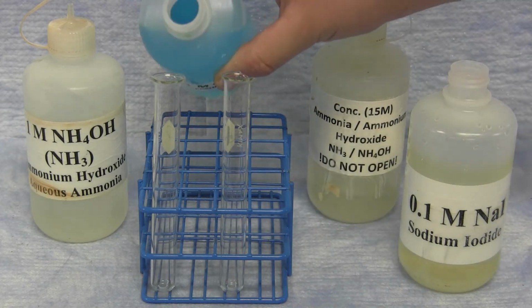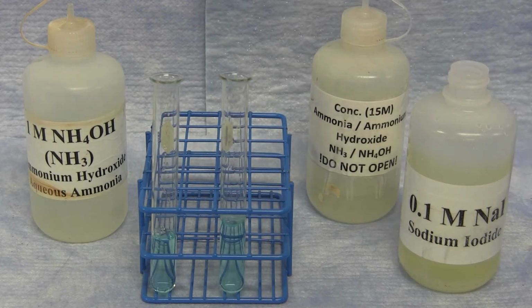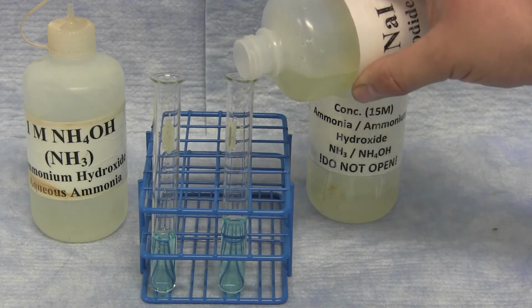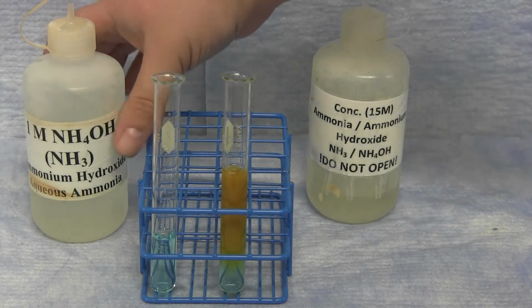In small test tubes, you're going to add a few drops or small amounts of different mixtures and different chemicals and recording what are the observations that you see that happen in these different chemical reactions.